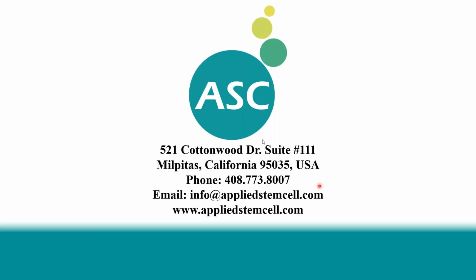I see one question here. What is the typical cost of making one antibody against the peptide antigen? Should you answer this question or should I answer this question? You can go ahead. So I would say it's around $20,000, including the animal immunization and the single B-cell cloning.